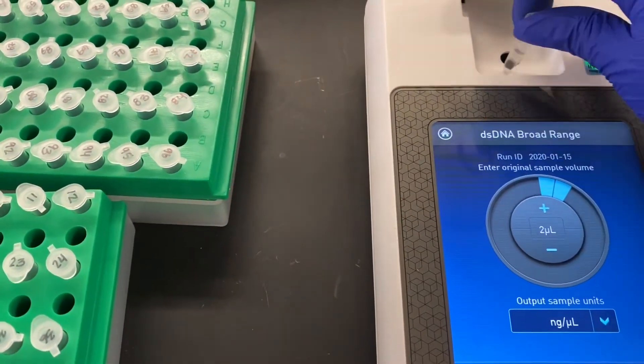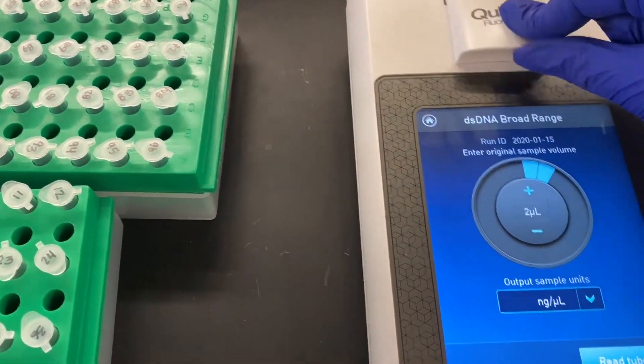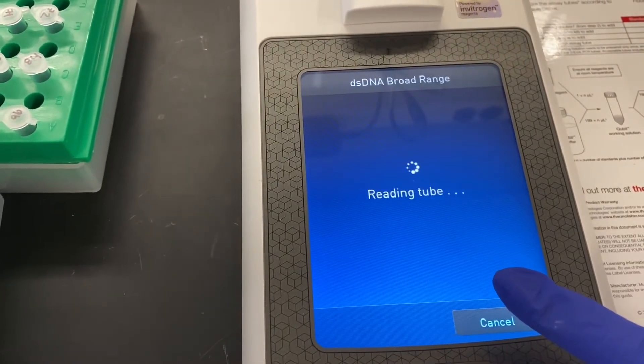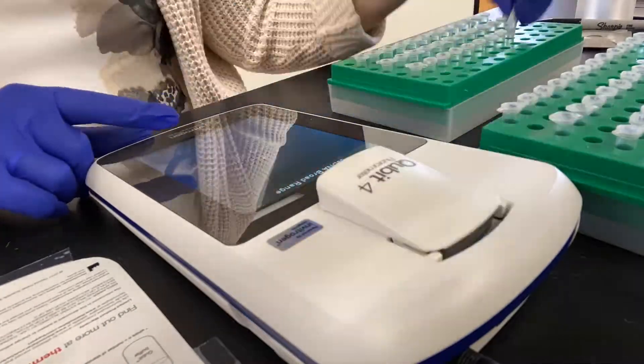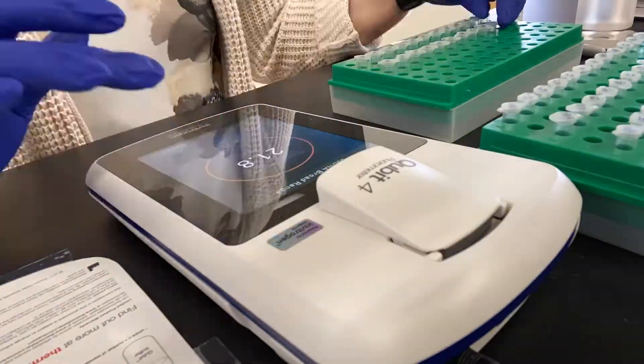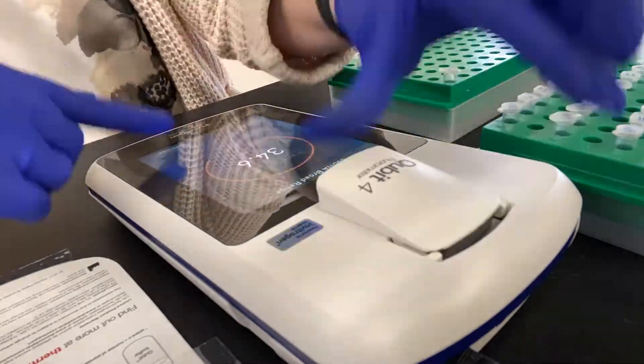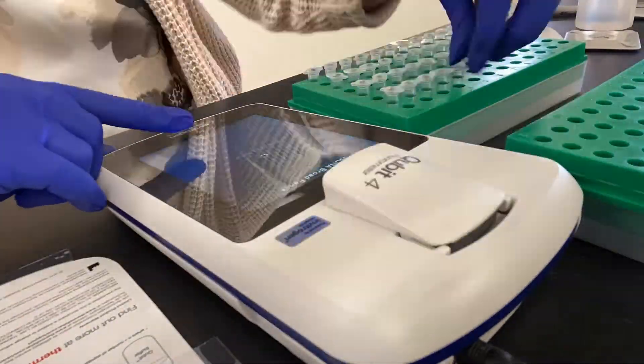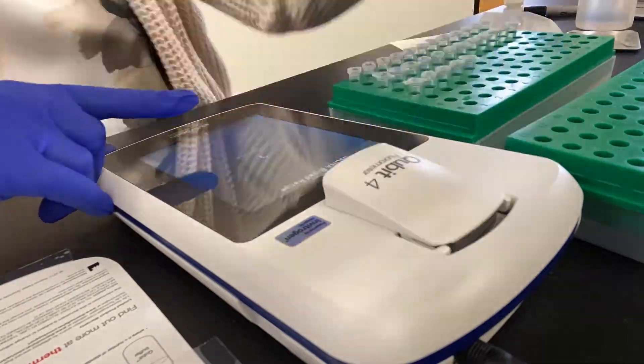We'll now read in and record each of the samples. For any samples that read out of range, I typically run those samples using a high sensitivity kit before jumping to the conclusion that nothing is present in that sample. This is because the broad range kit only measures down to one nanogram per microliter.